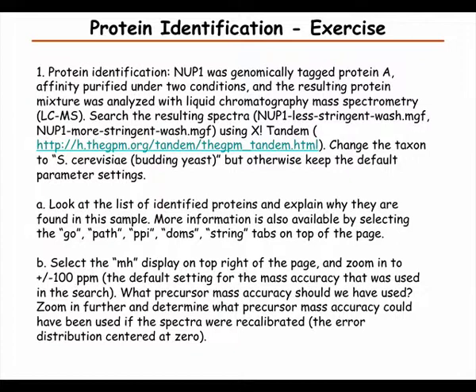So did anyone look at the more stringent wash, or the less stringent wash? Yeah. Okay. There are similar proteins like NUC1. Anything else that Dylan didn't mention? The number of hits is higher than the wash. Yes, so you get much more. Yeah, 129.